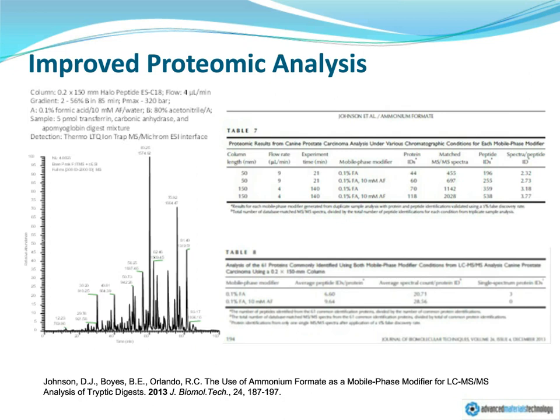And to summarize a series of publications in this area, the net effect is that the improvement in chromatography leads to significant improvement in proteomic analysis.